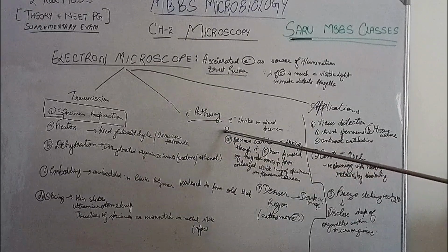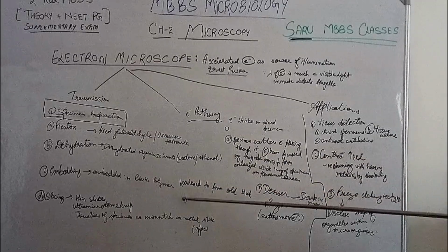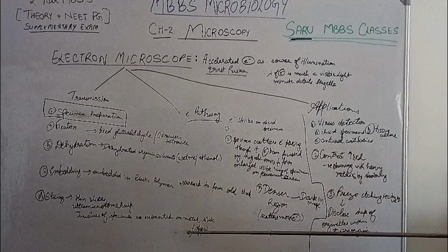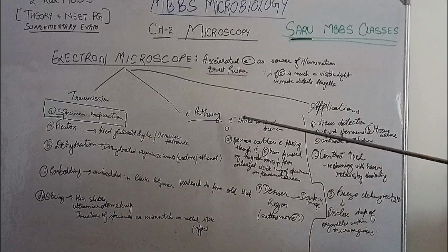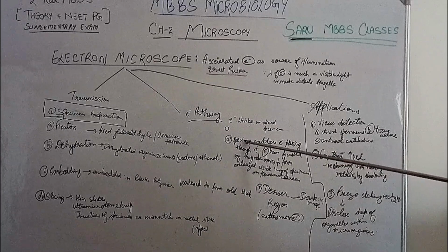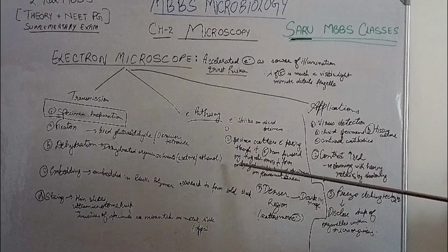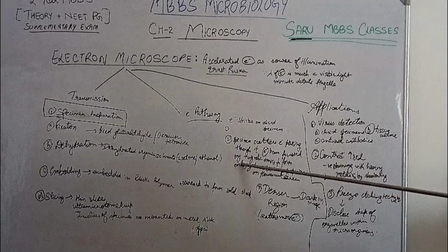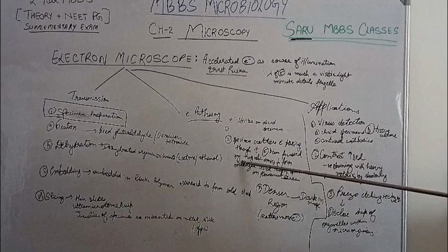First, electrons strike the sliced specimen. Here we did the slicing of the specimen mounted on the copper slide. So electrons strike this sliced specimen on the copper slide. Then the specimen scatters the electrons passing through it. As I explained earlier, electrons collide with air particles and scatter, so we need magnetic condensers.